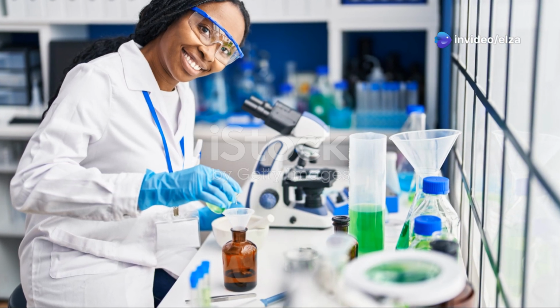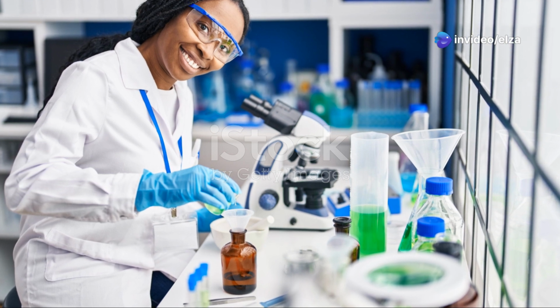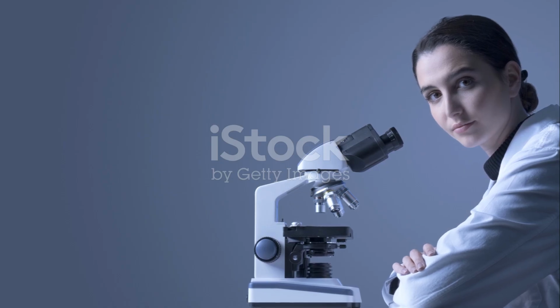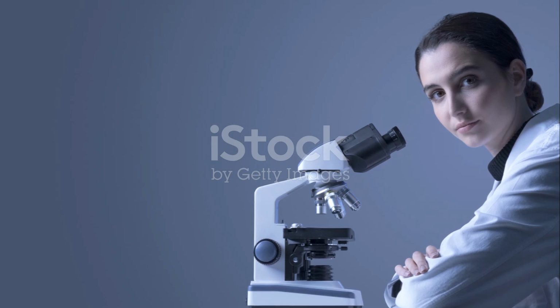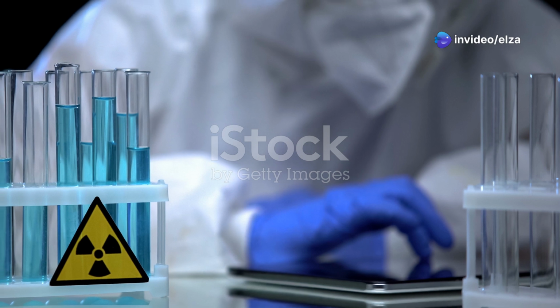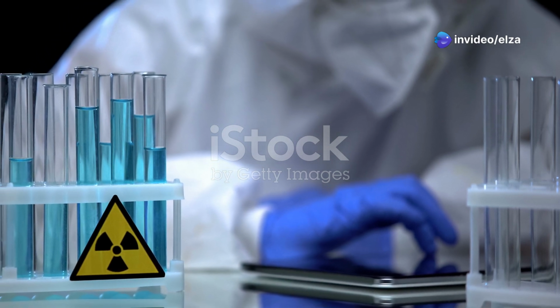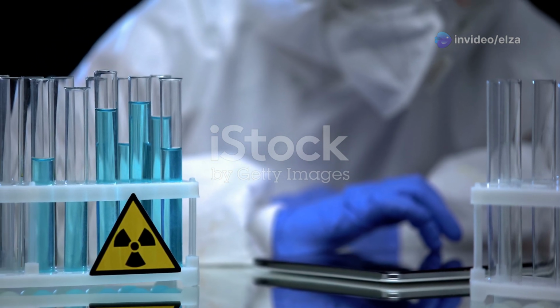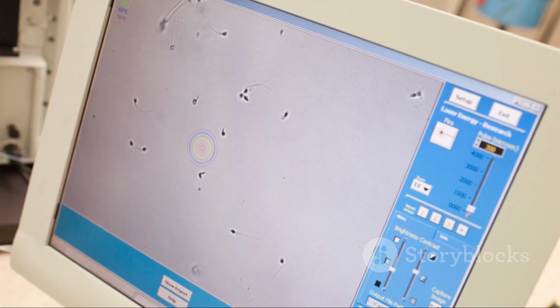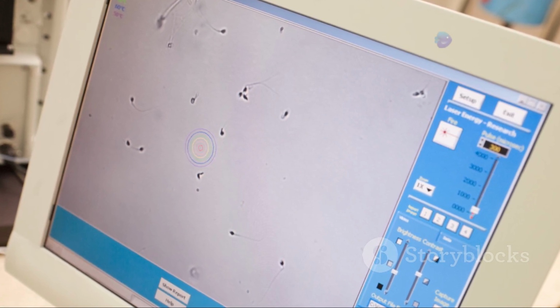Microscopic autoradiography is a powerful technique in cellular and molecular biology. It allows scientists to visualize the location of radioactive substances within cells and tissues. By using a radioactive version of the building blocks of a protein, we can track where they end up. This signal is captured on a special photographic film, creating a map of the protein's location.